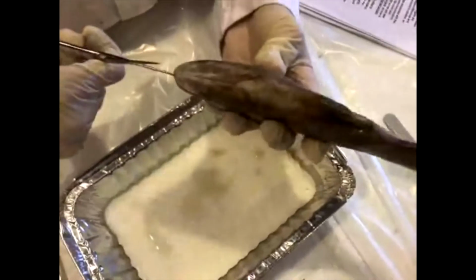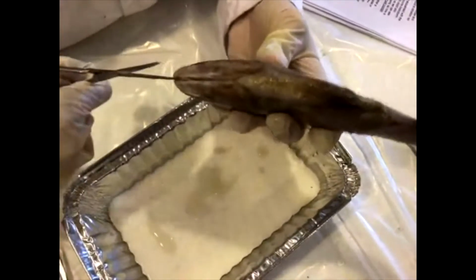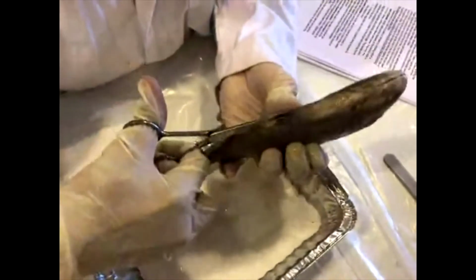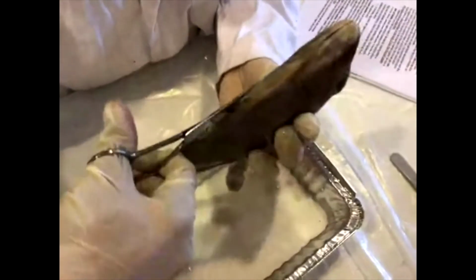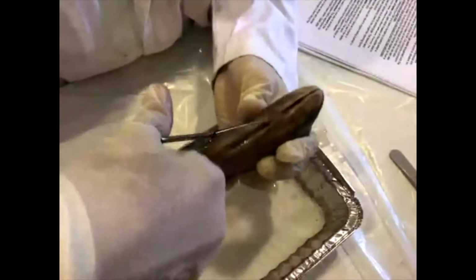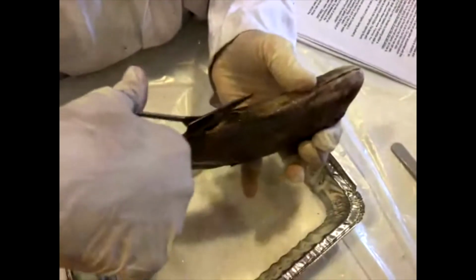So as I do that, I'm going to cut down the base of our fish here through some of the bones. I'm actually going to start at the other end. It's a little easier. And I'm going to start right here at the urogenital opening. And this is kind of a multi-purpose exit for the body. We'll talk about it in a little bit. Now I'm cutting quite shallow because I just want to get through the skin, the scales, the bones, and some muscle. I don't want to cut into the organs quite yet.